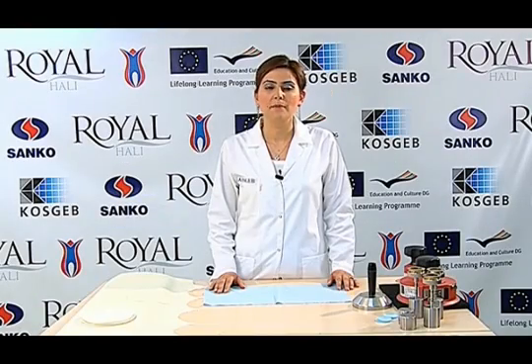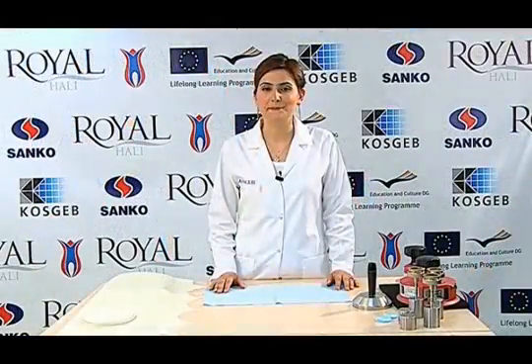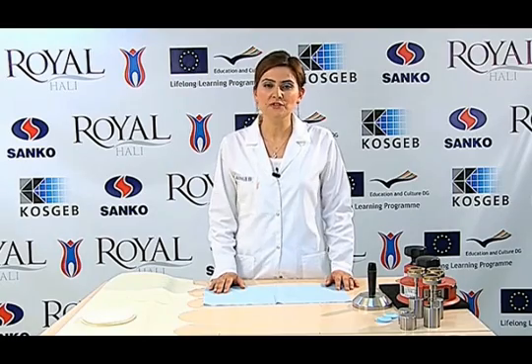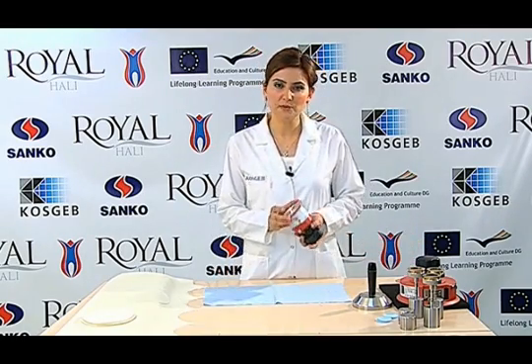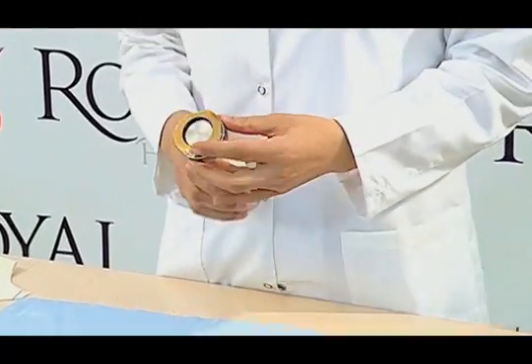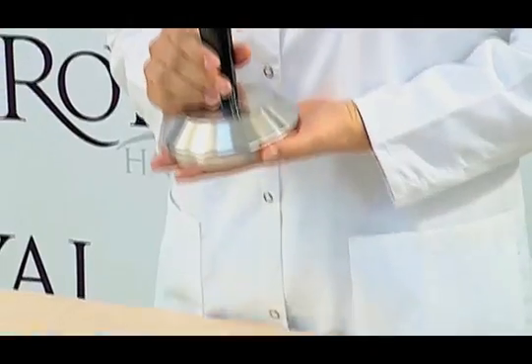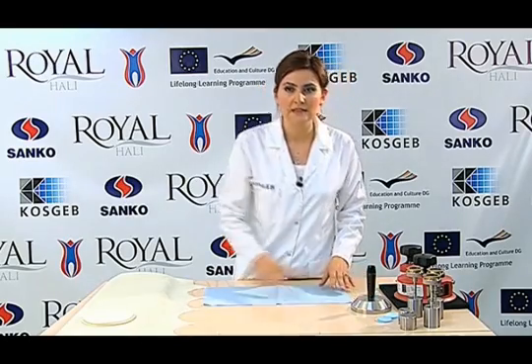Hello friends. This video demonstrates the determination of sample break in abrasion resistance of fabrics using the Martindale method — specifically, the number of cycles until the sample breaks. We will use the Martindale abrasion and pilling tester, a 38 mm sample cutter, a 140 mm wide abrasive cloth cutter, a sample holder, load cells, and the Martindale abrasive device with a presser foot and a 2.5 kg apparatus.